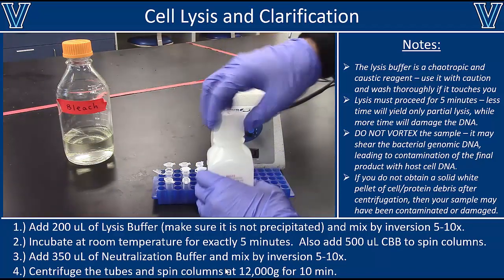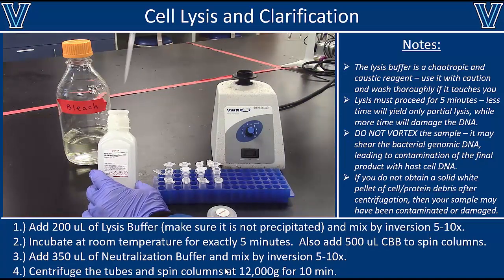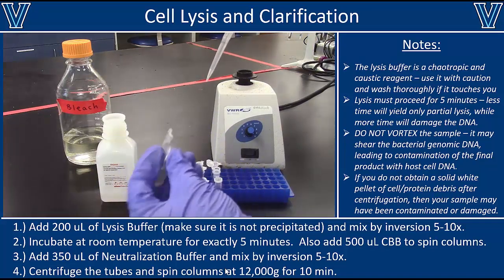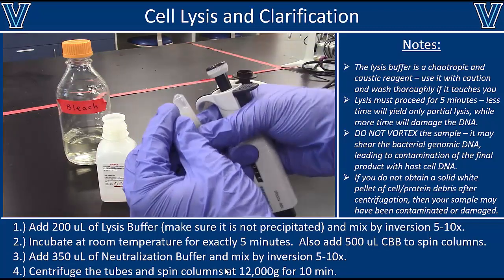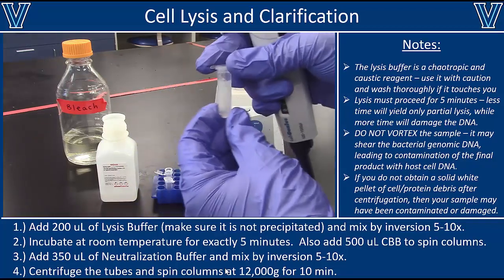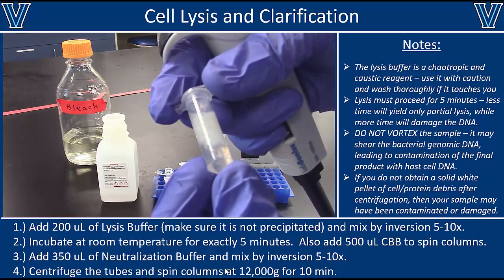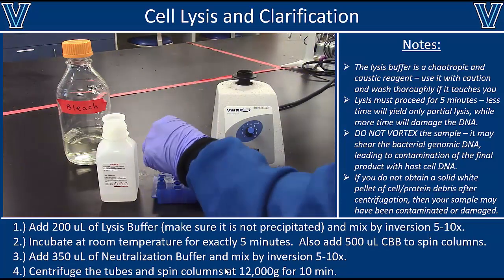All right, and then once that lysis is complete, after that 5 minutes, we're going to add neutralization solution. So again, what this does is it brings the pH back down to neutral after the lysis is complete. We don't want lysis to go any longer. If it does, then we risk damaging our plasmid or shearing the genomic DNA, which would then contaminate our final product. So once I add the neutralization solution, I invert it to mix it, and I should get something that looks like this. You should see a white snotty material and a clear liquid solution besides that.